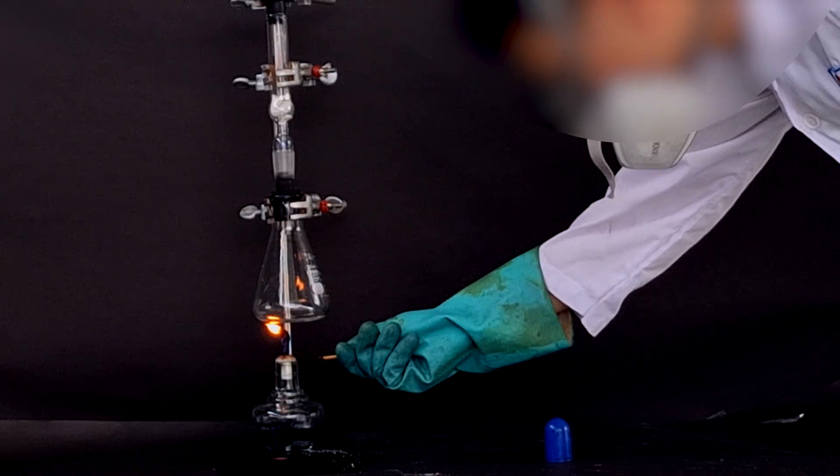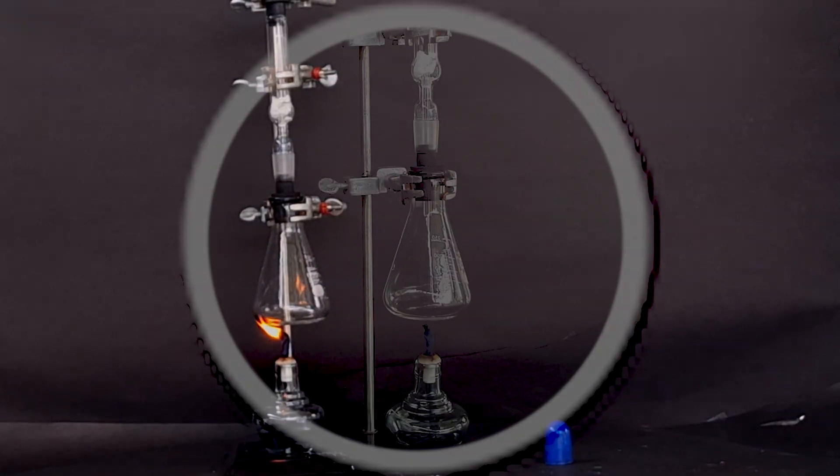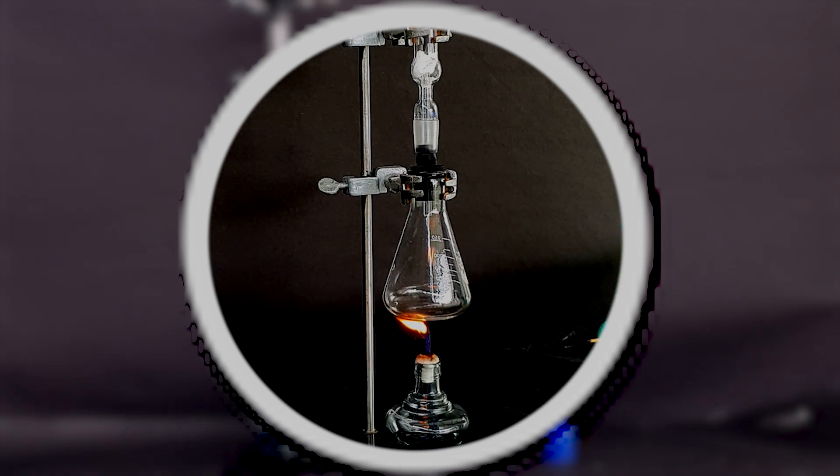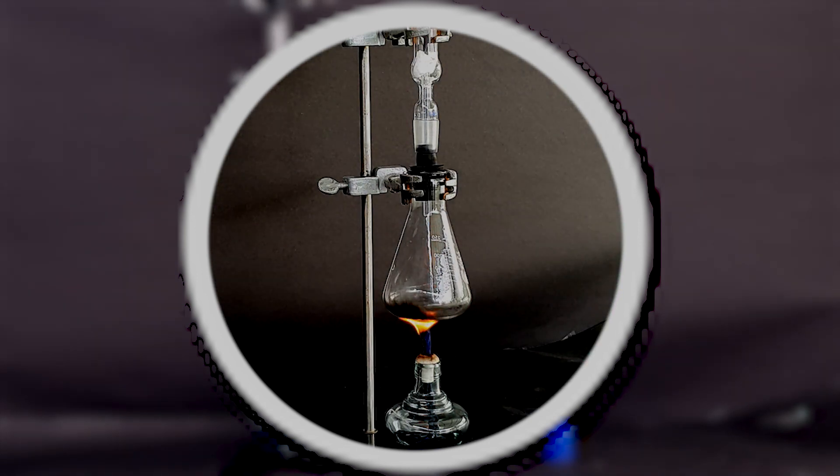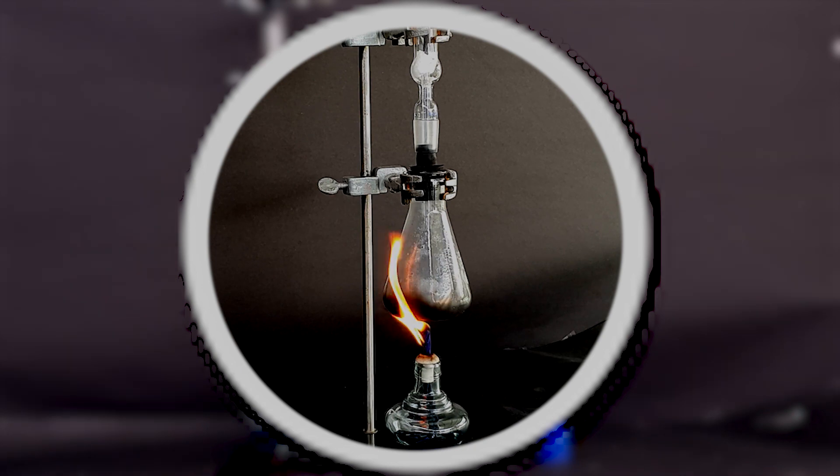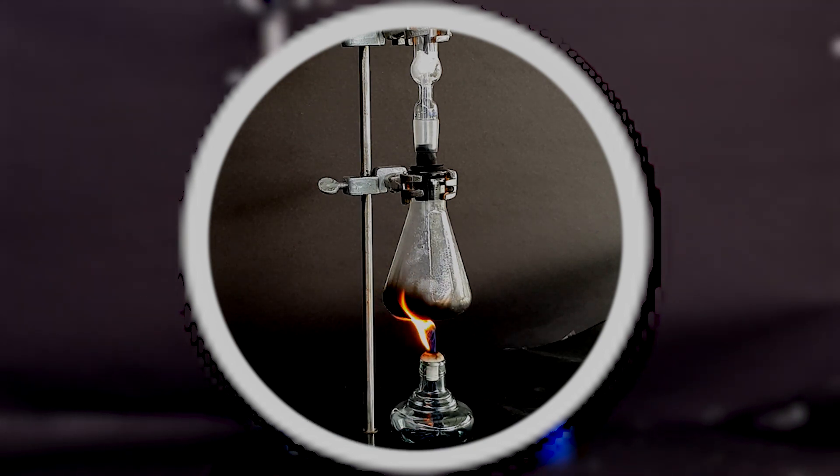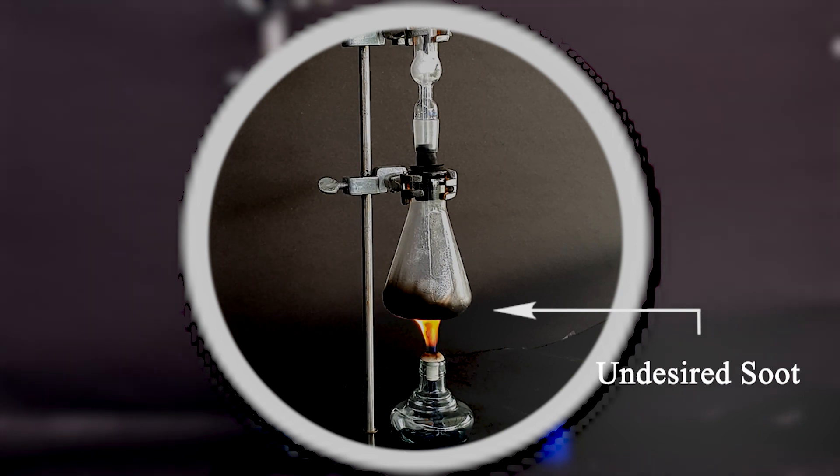As seen previously in this video, I am using an oil lamp filled with kerosene. However, it will be beneficial to instead use a Bunsen burner, or replace the kerosene with either methanol or ethanol, as the flames produced by these substances have less soot and odor.